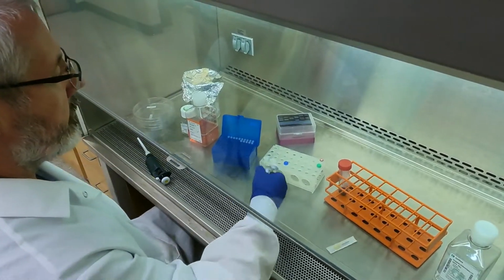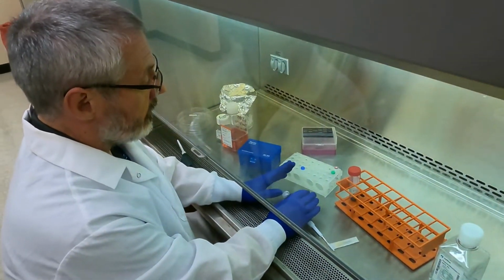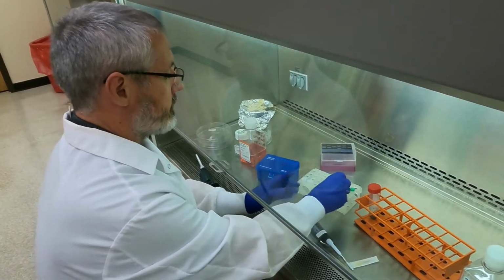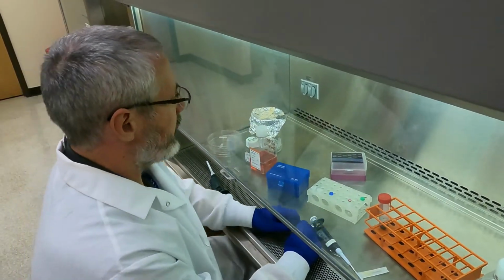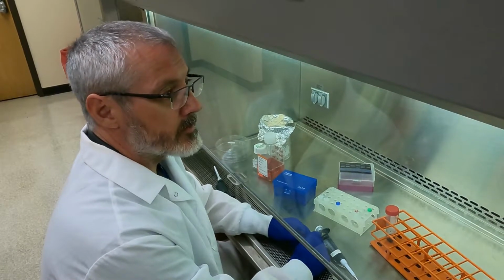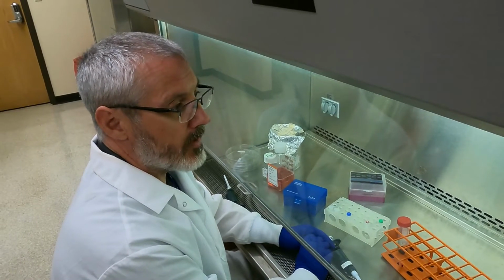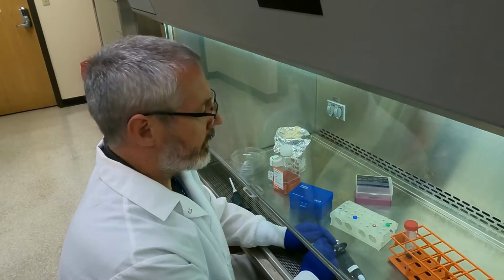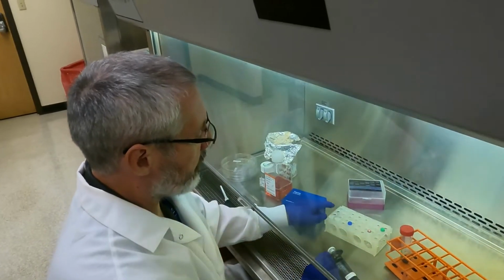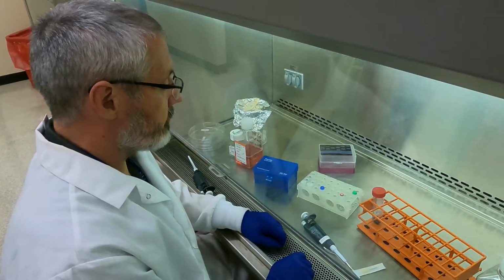Now we want about 200 microliters of cells at 5 times 10 to the 6 in buffer R. So what we'll do is we'll take these cells and we'll bring them up in 5 mils, and that will bring them to 2.5 times 10 to the 6, and then we'll take about 400 microliters of them and spin them down, and then take them up in 200 microliters of buffer R. And then to each of these we'll add 40 microliters, mix them quickly, and then we'll electroporate them. So that's the plan.